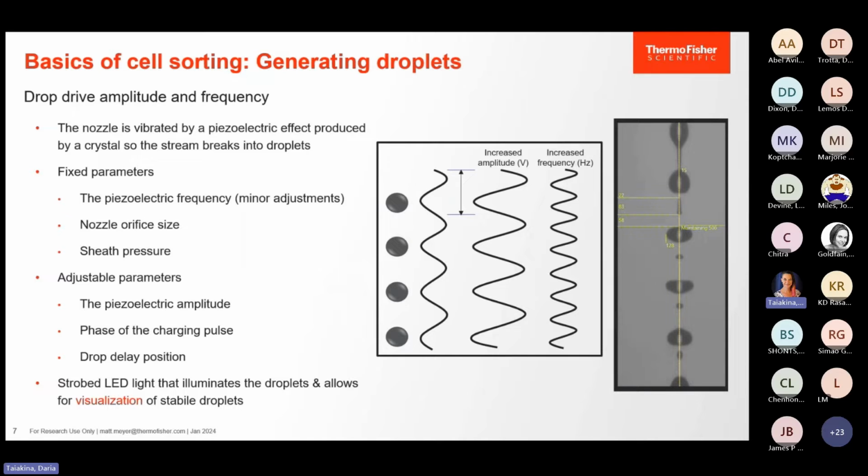One of the most important parts of the nozzle assembly is to generate droplets and make them stable and predictable. We typically use a piezoelectric crystal to do this. That crystal will vibrate up and down and produce a very consistent droplet. You can actually change the breakoff height based on the voltage applied to that crystal, and that's basically an energetic wave that's produced.